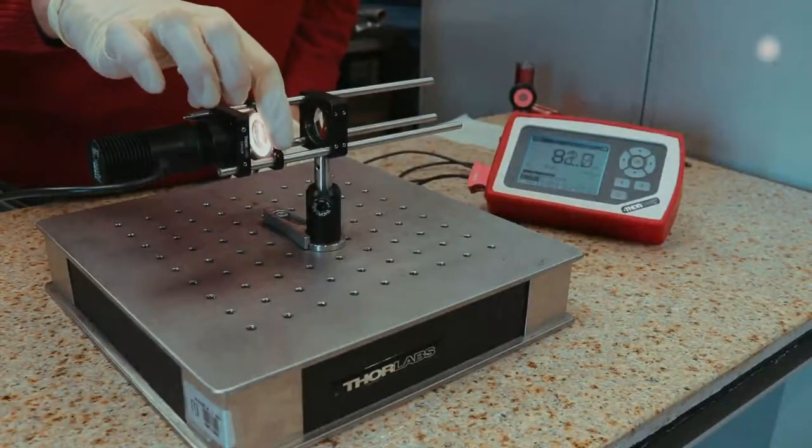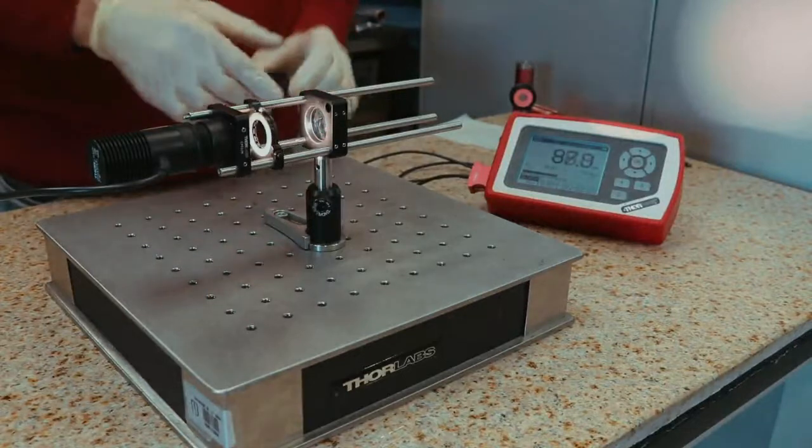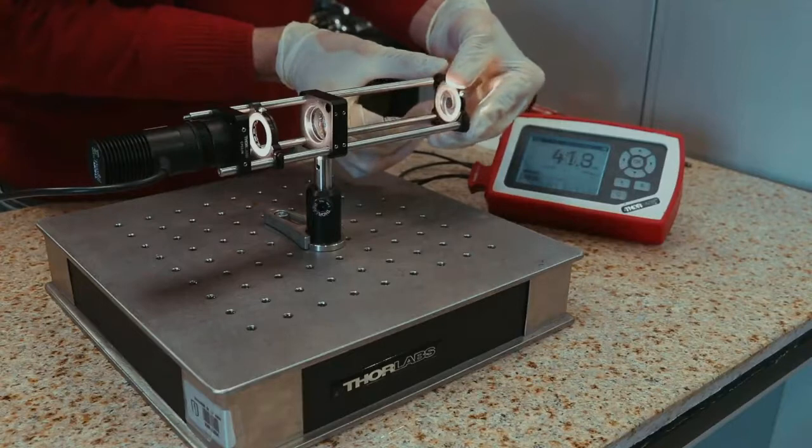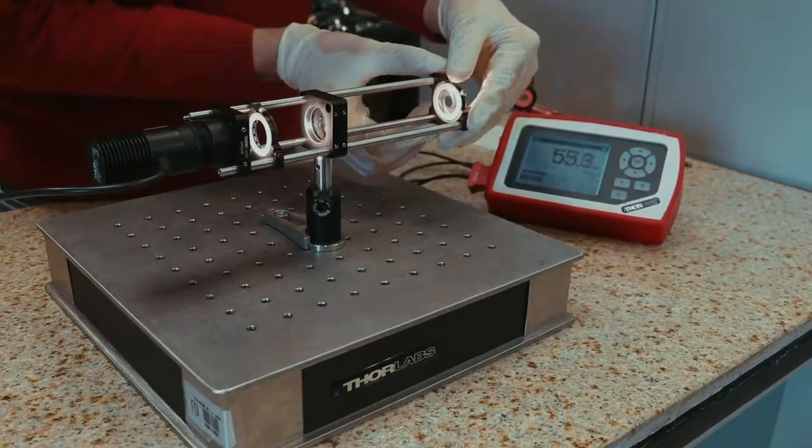Open the field diaphragm to its full aperture. Insert a cage iris after the first spherical lens. Close the second iris, the aperture diaphragm, to its minimal aperture.